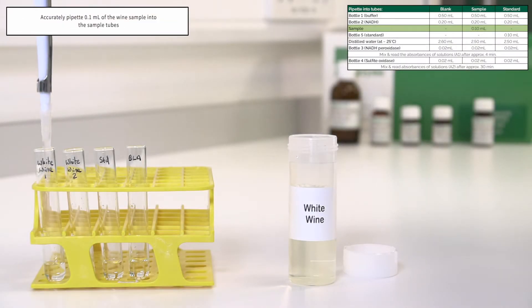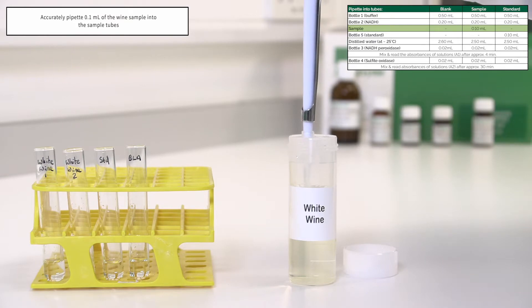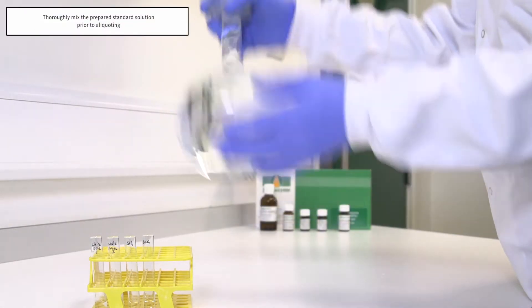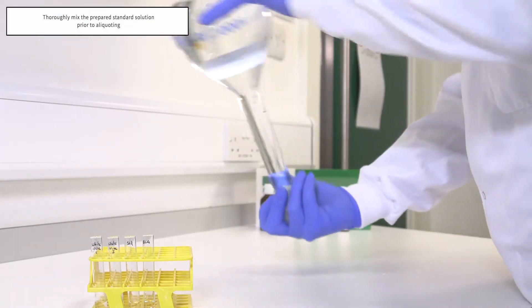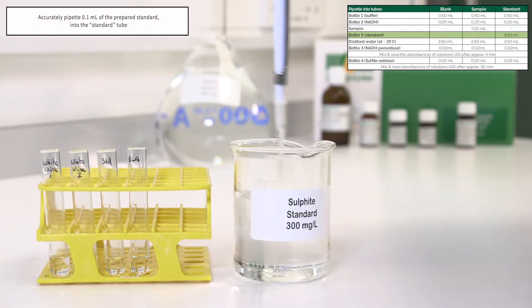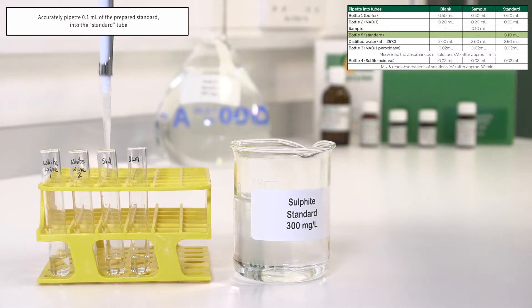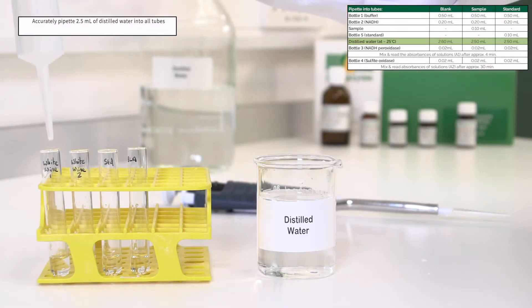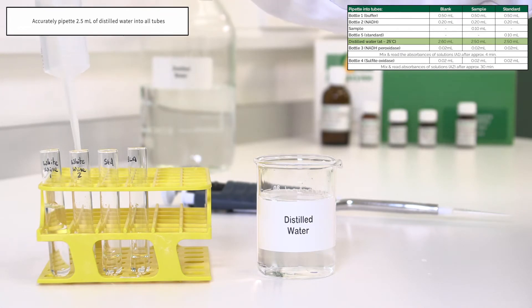Accurately pipette 0.1 millilitres of the wine sample into the sample tubes. Accurately mix the prepared standard solution prior to aliquoting. Accurately pipette 0.1 millilitres of the prepared standard into the standard tube. Accurately pipette 2.5 millilitres of distilled water into all tubes.